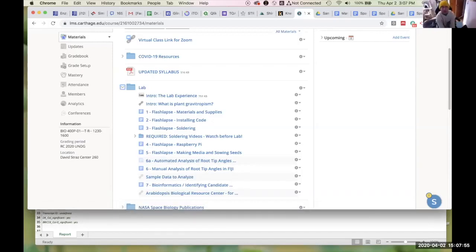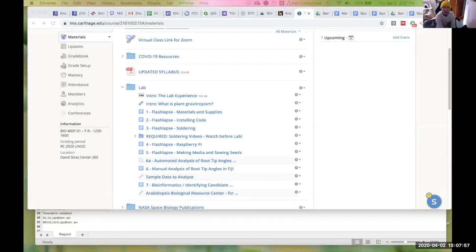That's why I'm really excited by RootNav2, because it runs through Python, so it can run on any machine. In the near future, again, I'm trying to get it up in the cloud. It's in Cyverse, so it's fully automated. But in the meantime, if anyone knows Python and likes to do Python coding, feel free to get in touch about that, and we can overcome that challenge together.